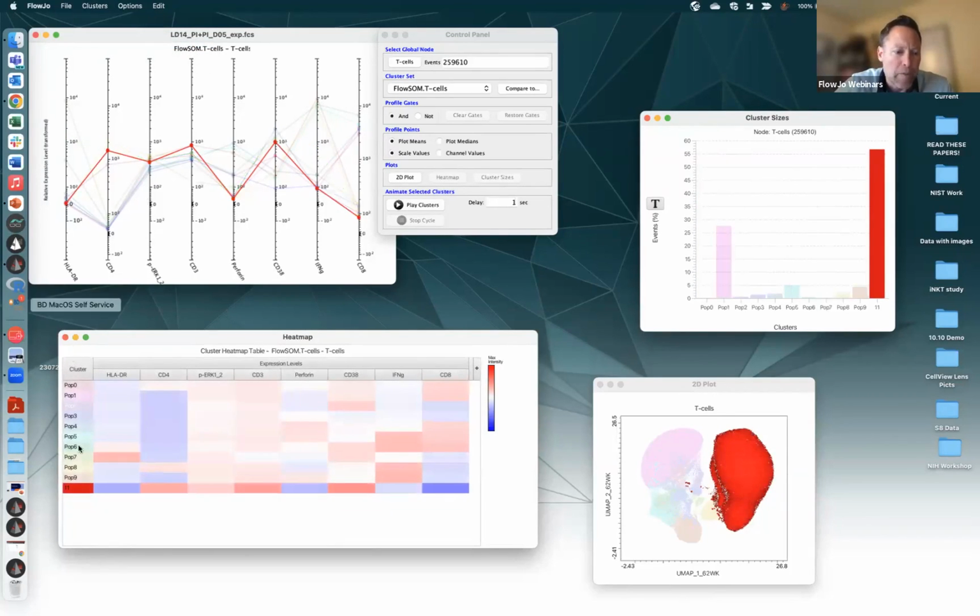There we go. We've now just got this cluster 11 instead of 0 to 9 and one more, that we've put those two things together. Maybe it was a bad job by me. I think these, even by eye, that really stands out, that maybe the HLA-DR was a separating factor, but never mind, pushing forward, assuming we've done a nice job of merging them. So we've got that merged population that's in there.